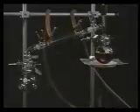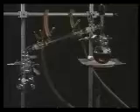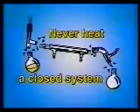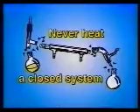A common tendency of beginning students is to over-clamp apparatus. Too many clamps can stress the glassware, causing it to break. Avoid placing undue pressure on the glassware. Tighten the clamps only enough to hold each piece in place. You are now ready to distill, but first ask yourself, have I made a bomb? Never heat a closed system. It may explode or fly apart.